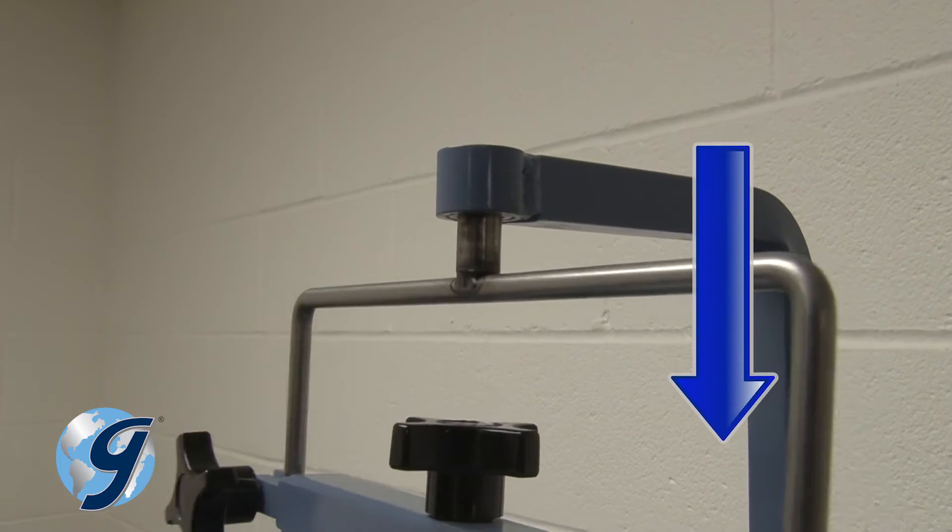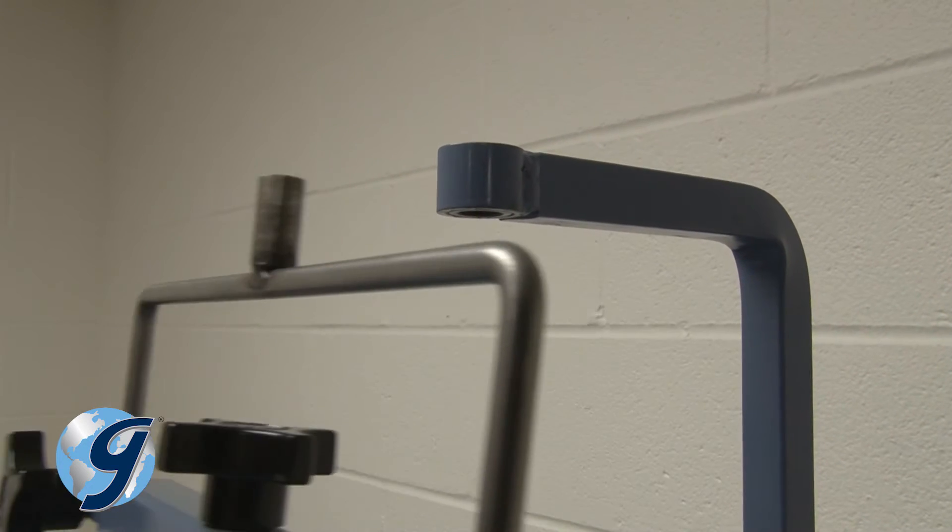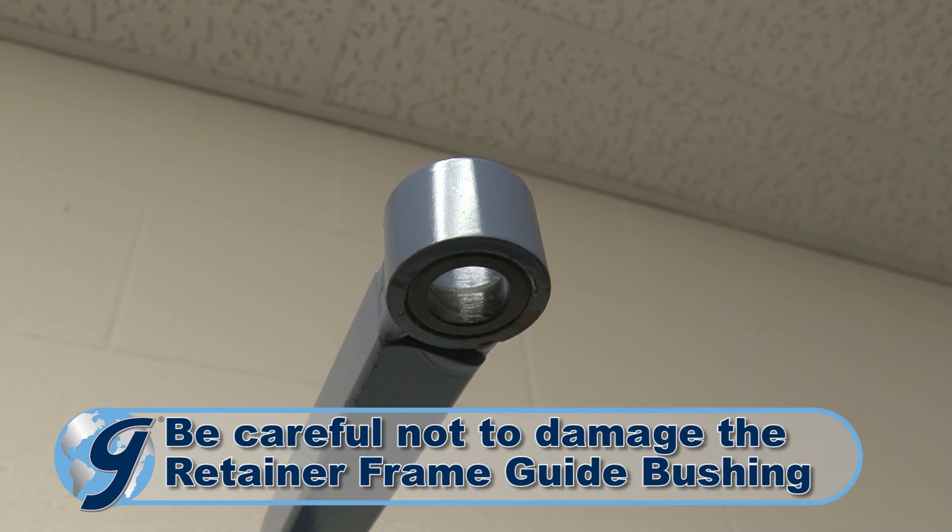Pull down on the sieve retainer frame until the metal stud is clear from the upper bushing housing. Be careful not to damage the sieve retainer frame guide bushing.